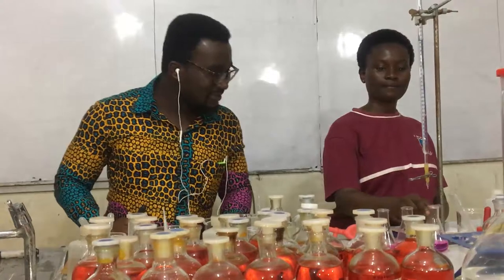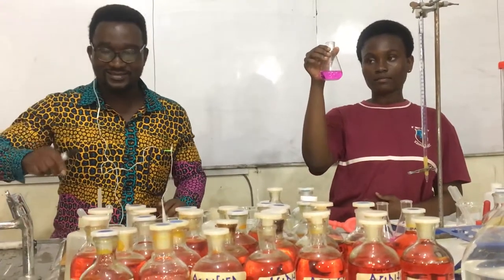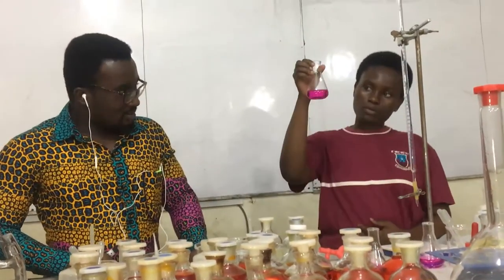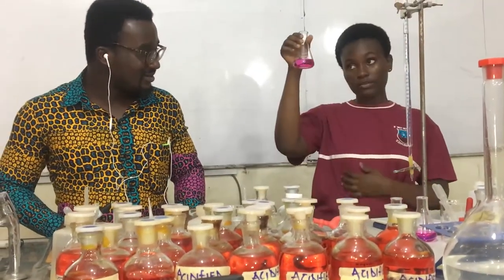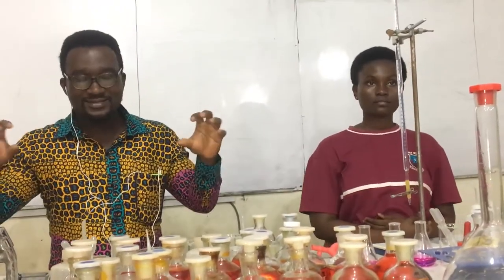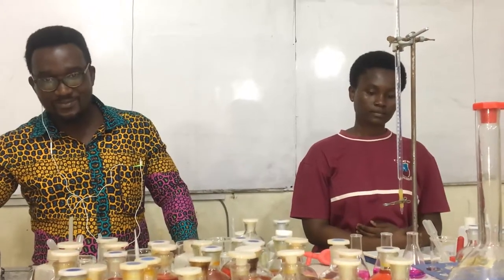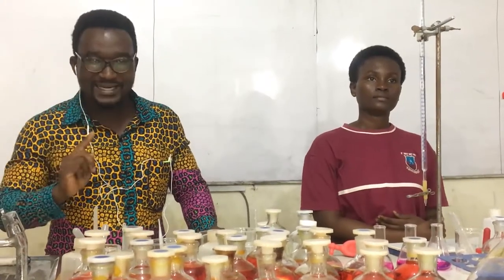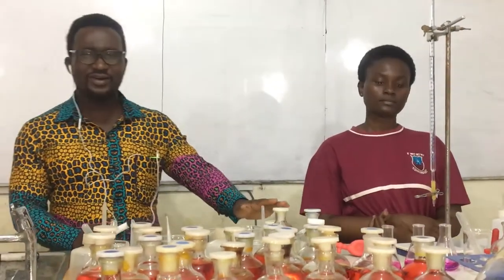So what volume really gave us these results? 23.3 cm3 gives us this color. What volume also gives us that? 23.2 gives us this color. What gives us this? 23.3. So, see, the other time we discussed that there is something we call the titre value. The titre values, there should be consistency. I told you that the differences between them should be plus or minus 0.2, plus or minus 0.1. Realize that their values are very consistent.